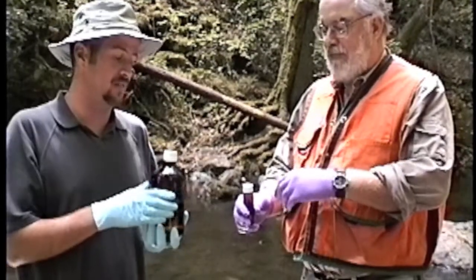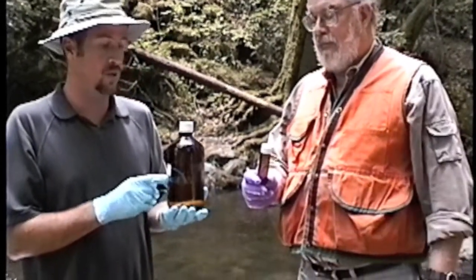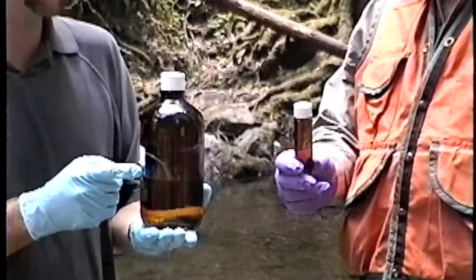The process for filling a VOC vial begins with filling one organics bottle with no headspace, which is the same method as doing a grab sample, as demonstrated previously.